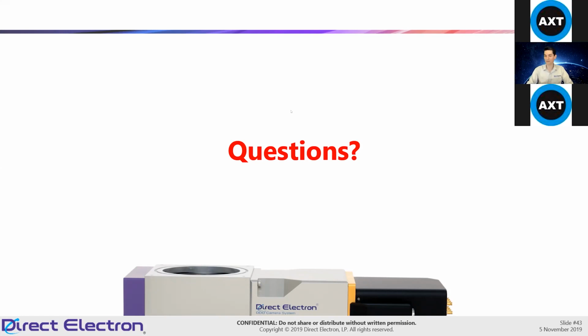So that is something I did not mention. In terms of integration with other software, there's no integration at the moment with EPU. We've asked and had discussions with Thermo about that, but as far as I know, no progress. But with JADAS, yes, we're completely integrated into JADAS. And in fact, at the University of Glasgow, that's pretty much all they use to collect their data. They do everything with JADAS.